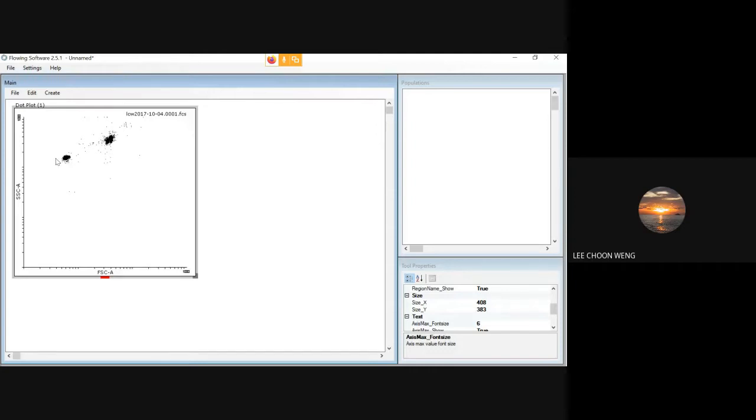So if you remember during our lectures, Synechococcus, if you look under the epifluorescence microscope, you can do a direct count. It will fluoresce orange. But for Prochlorococcus, you cannot use epifluorescence microscopy. You have to use flow cytometry. The main problem is because the fluorescence fades very fast, so you need a flow cytometer in order to visualize them.